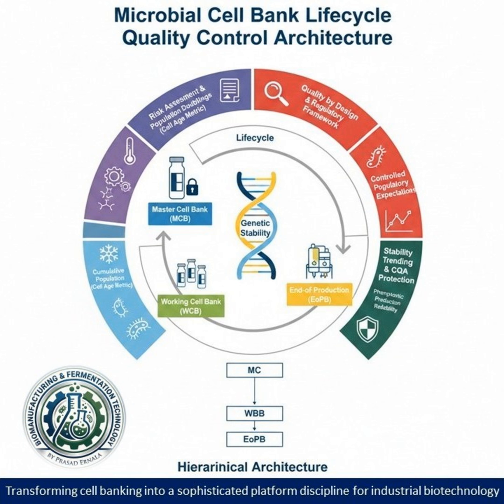And what's its early exponential growth rate, its mu, in production-like media? If those are off, your reactor run is going to be unpredictable. That connects the lab quality directly to the industrial outcome. Okay, so now we move to life cycle control.